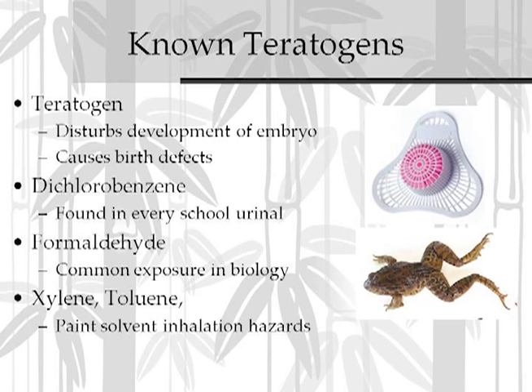Basically what it does is it interferes with your sense of smell, kills off your scent organs, so you can't smell anything besides it. And you notice you don't even smell it after a while because essentially it deadens your sense of smell. It does nothing to sterilize anything. It's not a disinfectant. It's just a fragrance. It's just a highly toxic, birth defect causing fragrance. So this is one we recommend just be eliminated from schools. There's no real place for it.